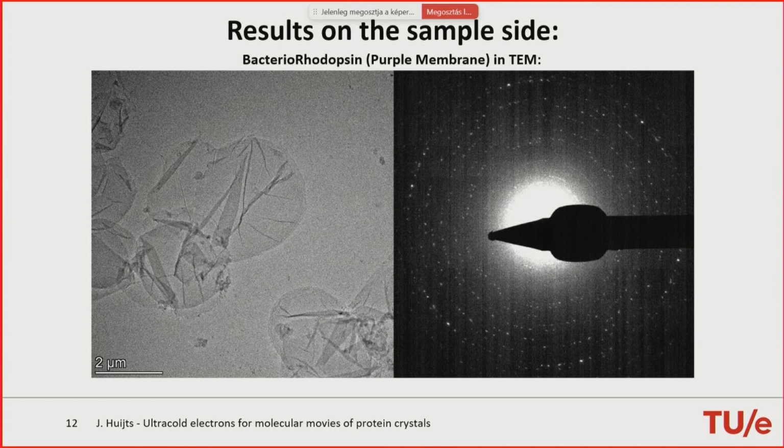So you get all these wrinkles, which means that in your diffraction pattern you get all these different copies of your diffraction pattern at different angles, sort of like a twinning problem, but of a higher order. But I was lucky enough to run into Richard Henderson himself about a week ago, who gave me some tips to both increase the crystal size and improve the flatness of these crystals. So that's something I'm going to try in the coming months.